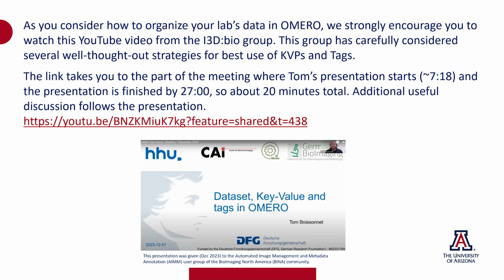OMERO provides a number of options for organizing your data, and this video presentation, again from the German bioimaging group, is a nice introduction to the whole issues of data sets, key values, and tags. It's only about 20 minutes long, and the link lets you skip the beginning part, and the question and answer after the presentation is certainly very optional.